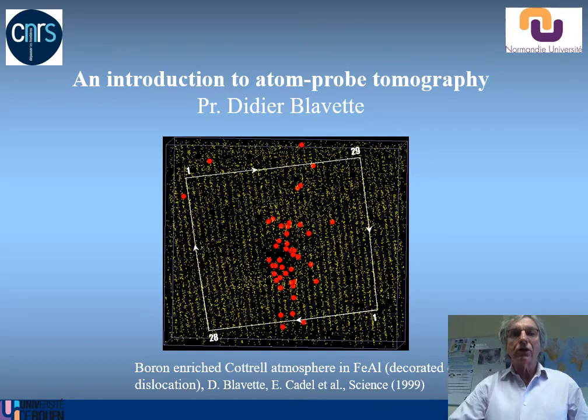Hello, it's a pleasure for me to give this lecture on atom probe tomography. And just as in the introduction, I would like to show you this image. This is the 3D reconstruction following the analysis of intermetallics, in fact, iron-aluminium intermetallics that were doped with boron.